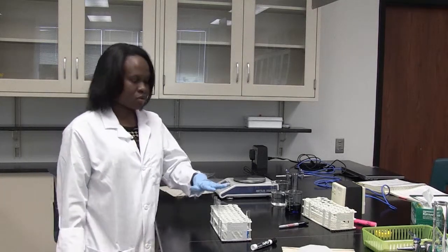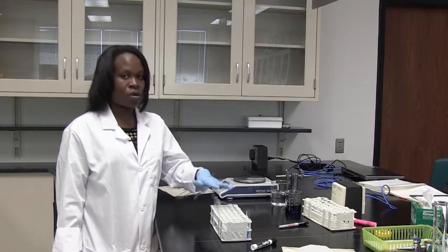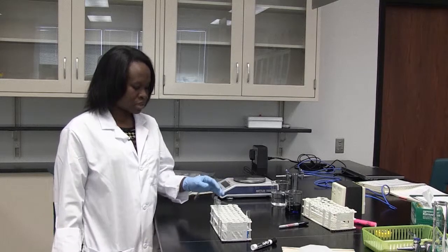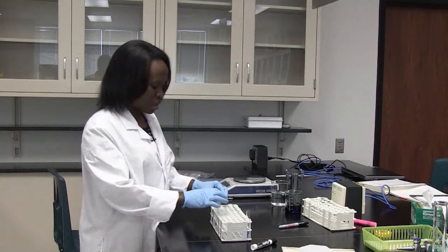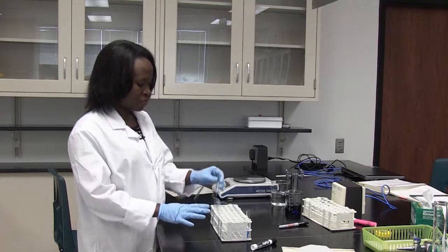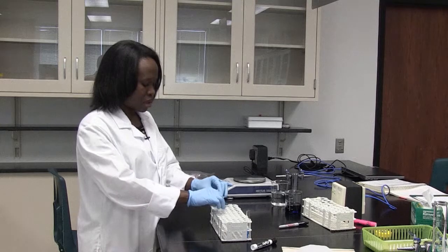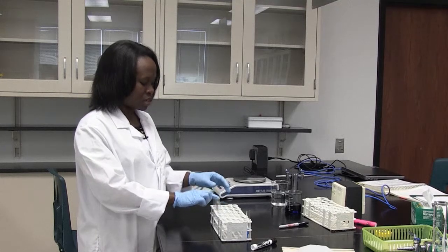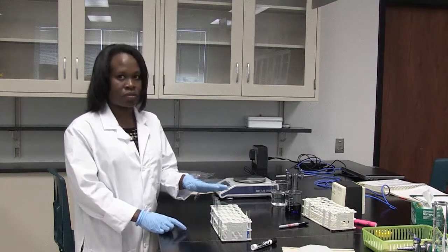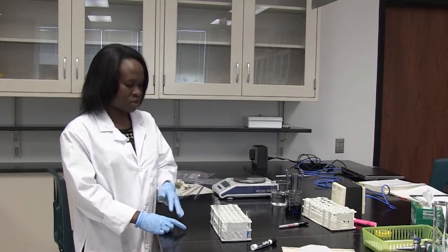Now, as an example, I'm going to make up a series of 1-in-3 dilutions. So that means when I'm finished doing my serial dilution, all my test tubes, except for the first one, which has the stock solution, will each have a dilution factor of 3, since we're doing 1-in-3 serial dilutions.